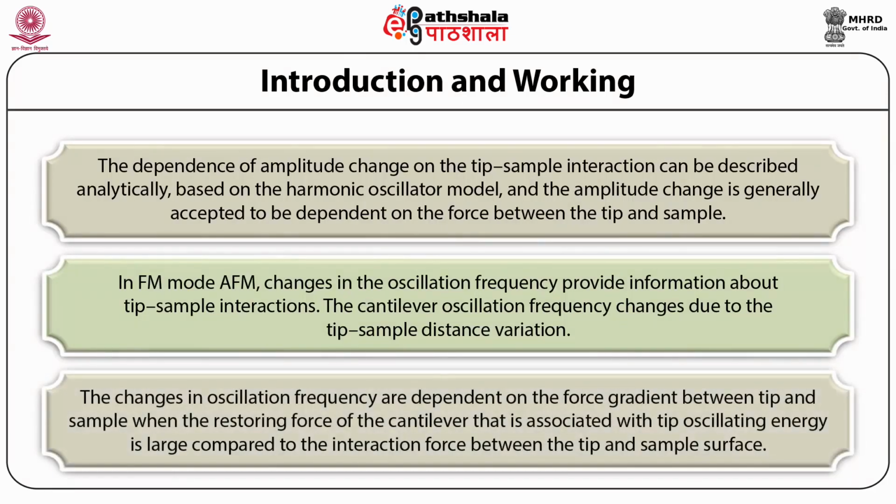The changes in the oscillation frequency are dependent on the force gradient between the tip and the sample when the restoring force of the cantilever, which is associated with the tip oscillation energy, is large compared to the interaction force between the tip and the sample surface.